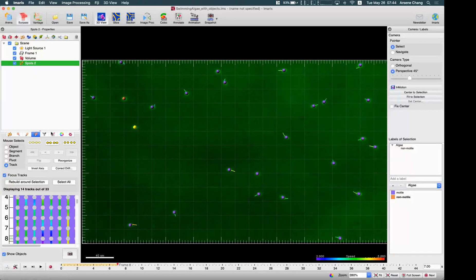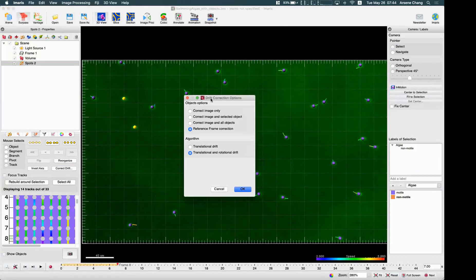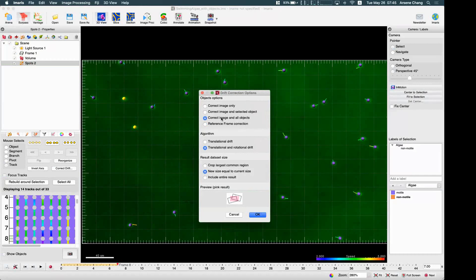For this one, if you want to do the drift correction, go to Edit Tracks, and here you will see a Correct Drift button. So you can select the ones you want to use as the reference for the drift correction, click this button, and say 'Correct Image and All Objects.' Here we have different options — these spots are being created after the track.